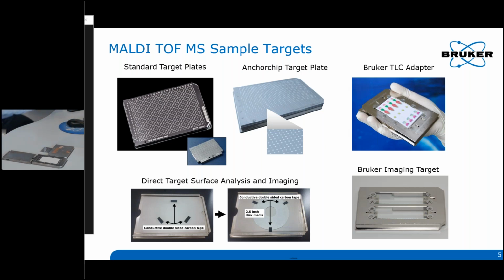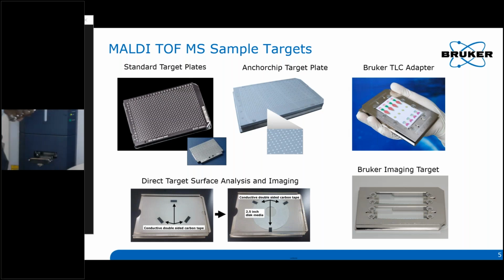So I'm going to go ahead and introduce this into the instrument while we look at the other targets. Basically, when you're done preparing your sample, you just put your target in and then hit inject. Inject and eject in and out, just like you would a CD on a computer.